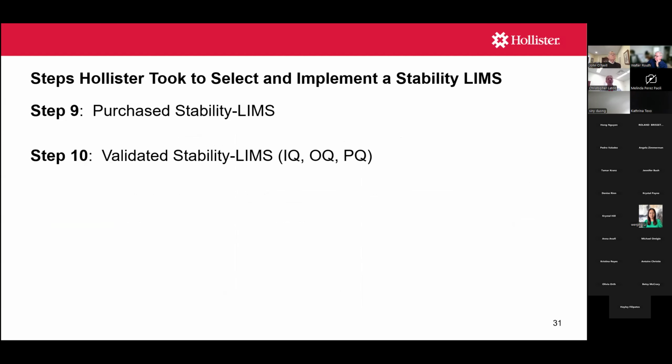So next, we purchased the Stability LIMS from the vendor, and then step 10 was to validate the system. So this is your IQ, OQ, PQ, which is very important.